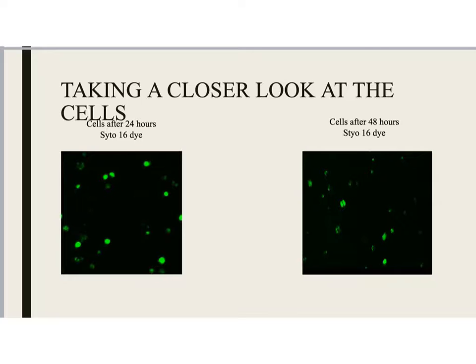Here you can see that we did see forms of apoptosis, and there could be more apoptosis in the neon cells, but in the brightness we had on the microscope, they're not able to be seen, because if we were to dim down the brightness, then we would have lost all the other cells that I just circled.